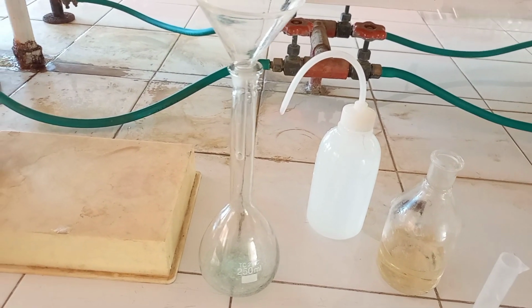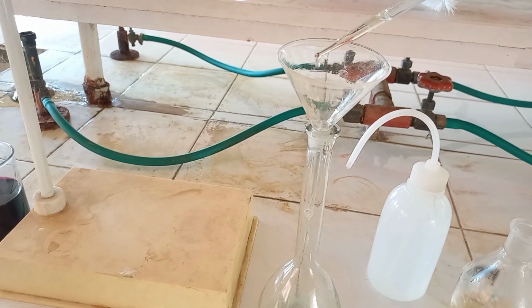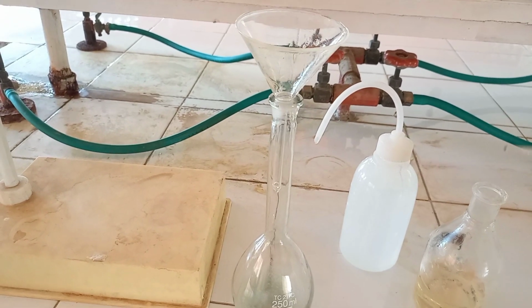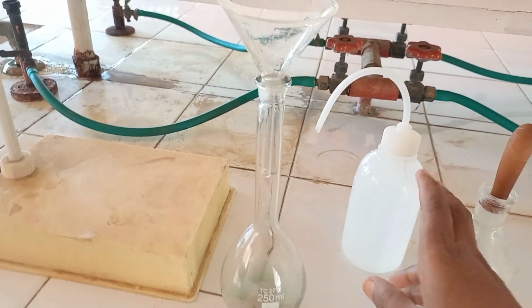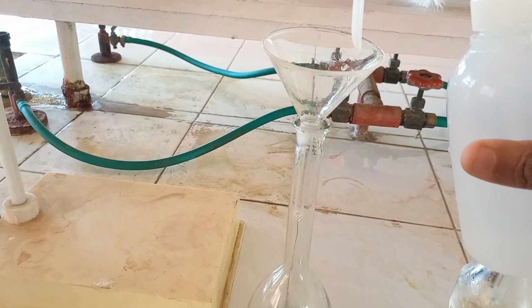Now after this, add 2 to 3 drops of concentrated H2SO4. Here we are pouring concentrated H2SO4 to prevent hydrolysis of ferrous ions to ferric ions. It is a very mandatory step, otherwise the color of your standard solution will turn brown.